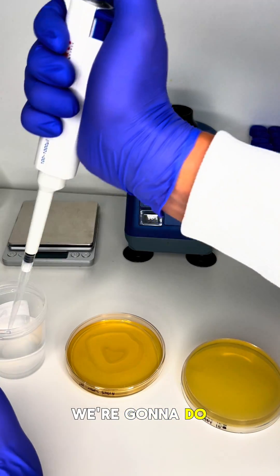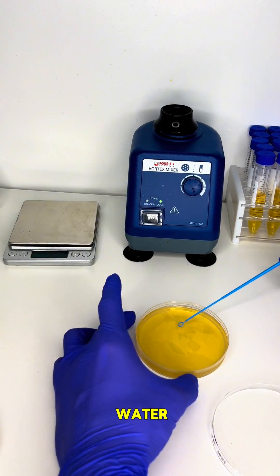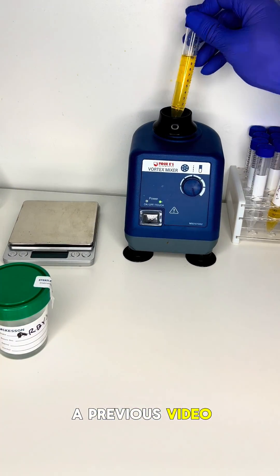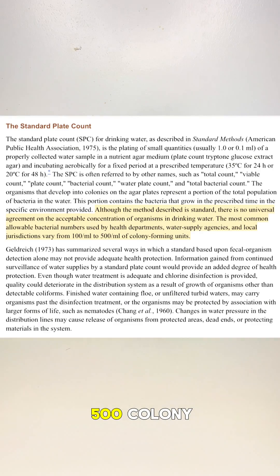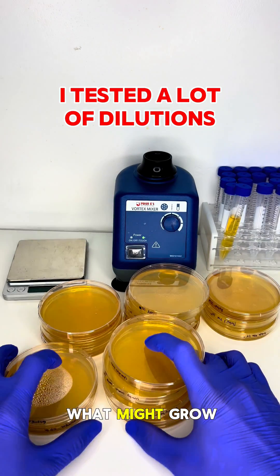The first test we're gonna do is a quantitative test, meaning we're gonna see how much bacteria is in the water. Remember from a previous video I said that we don't want to see more than 500 colony forming units in the water. With that said, let's go see what might grow.